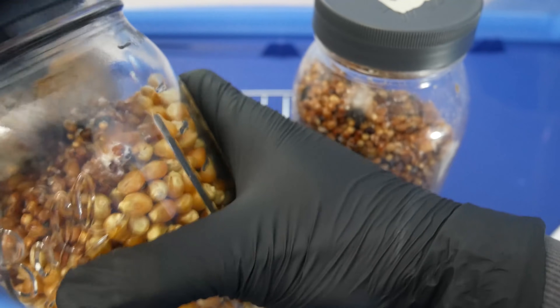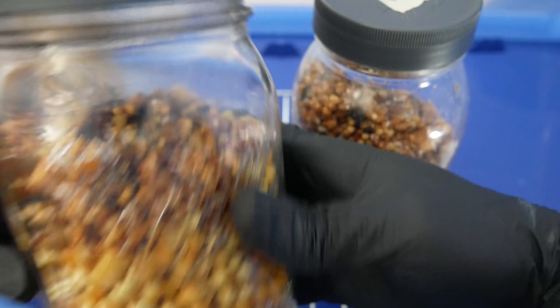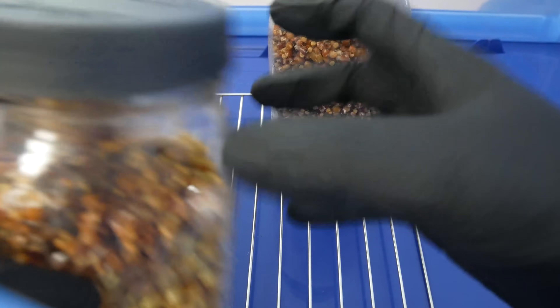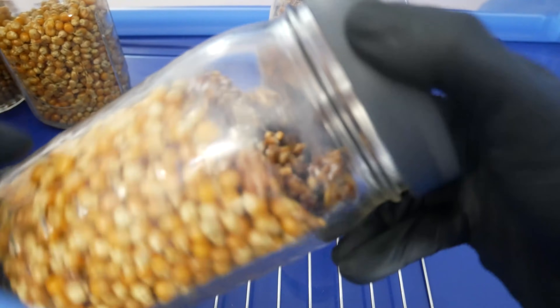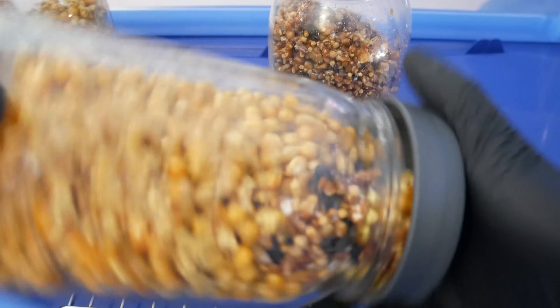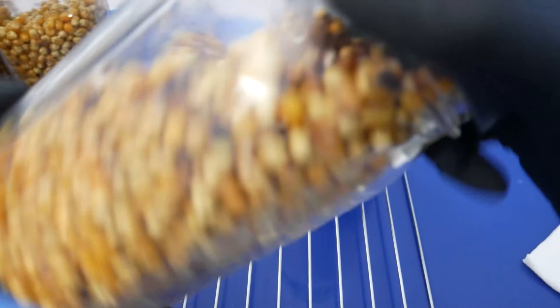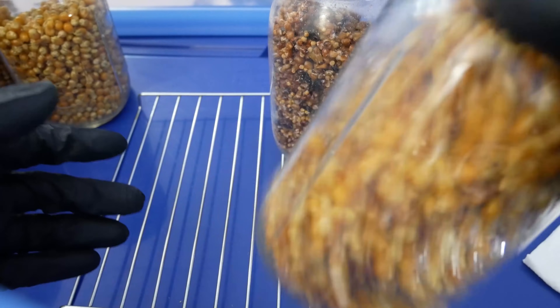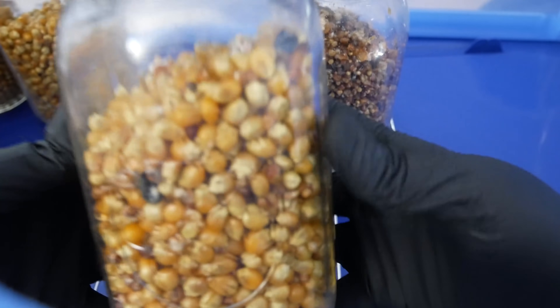Once you transfer a bit of colonized mycelium into the new jar, close up the lid and give it a nice good shake to distribute the mycelium throughout the jar. You want multiple inoculation points throughout the jar so the mycelium can spread out and colonize the grain much more efficiently. Give it a good rumble and you're all set.